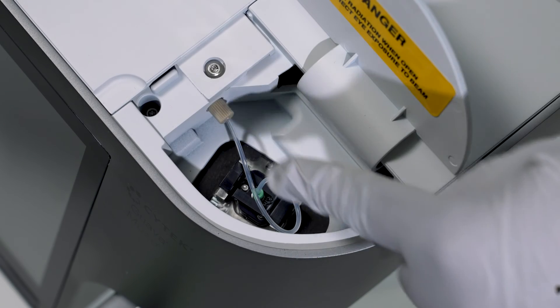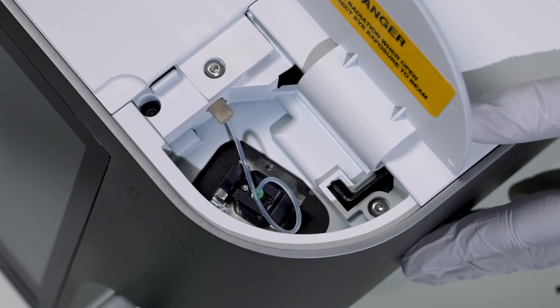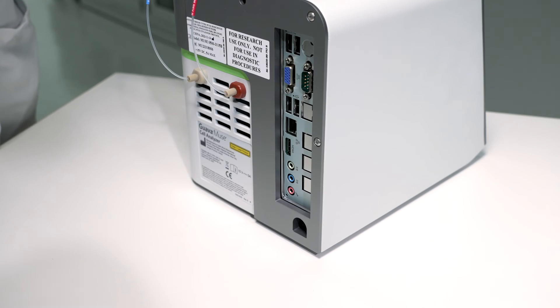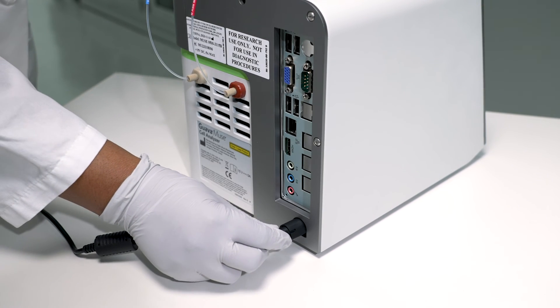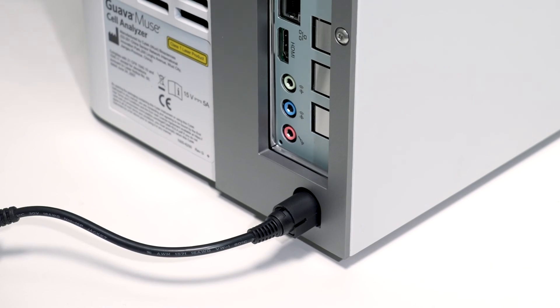Now the fluid bottles and flow cell are installed. You are ready to switch your instrument on. Connect the Muse to its power source by plugging the cord securely into the back socket.